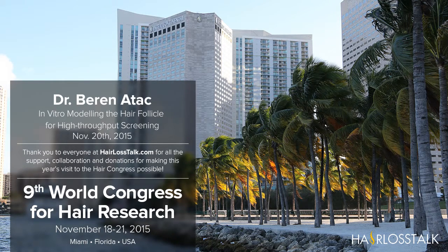When we expanded them, we had them in suspension, but we let them condense under low attachment conditions. So they form spheres in 3D. And that's the point where we start to see the changes. Claire would also agree with that, I think. So in the end, we start the co-culture with melanocytes and keratinocytes. At this time point, we call this an organoid, or the model microfollicle. With this, we reach the complexity of the tissue like this. So we see an organized structure.